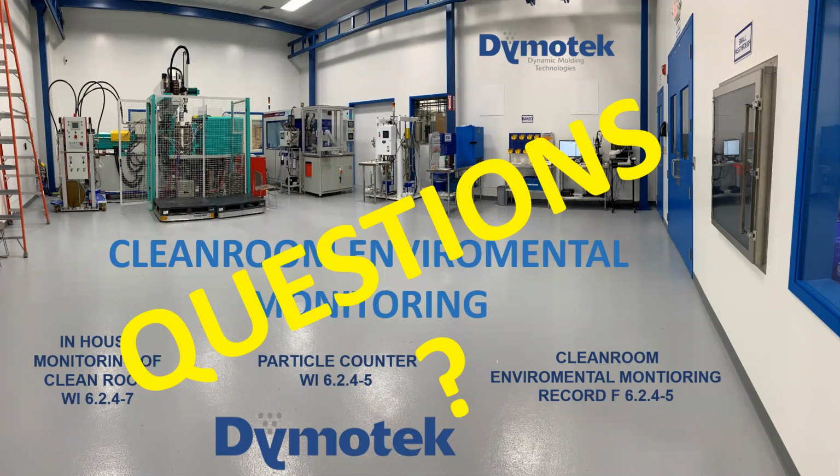As we just previously discussed, if you feel comfortable with the training that you have just received and you have successfully taken a particle count that has been verified and recorded onto a blank environment monitoring record that will accompany your training attendance sheet, then please sign off the training sheet. If you still have questions, please contact your trainer and/or supervisor, and we will assist you in further training.